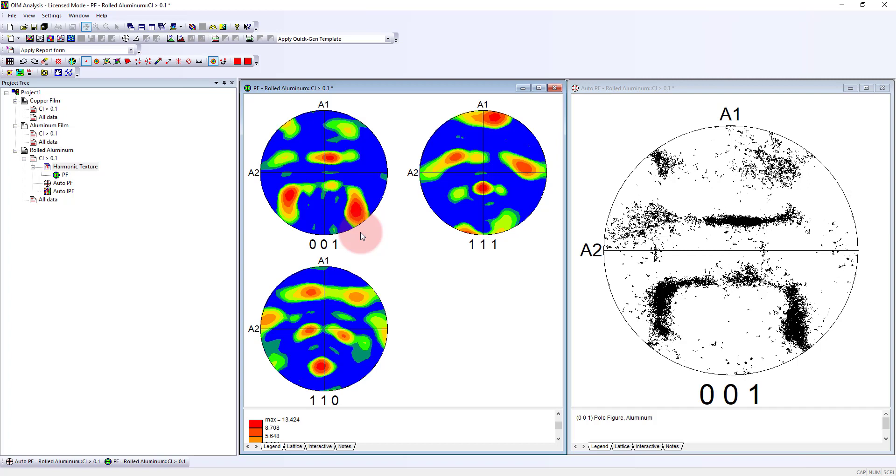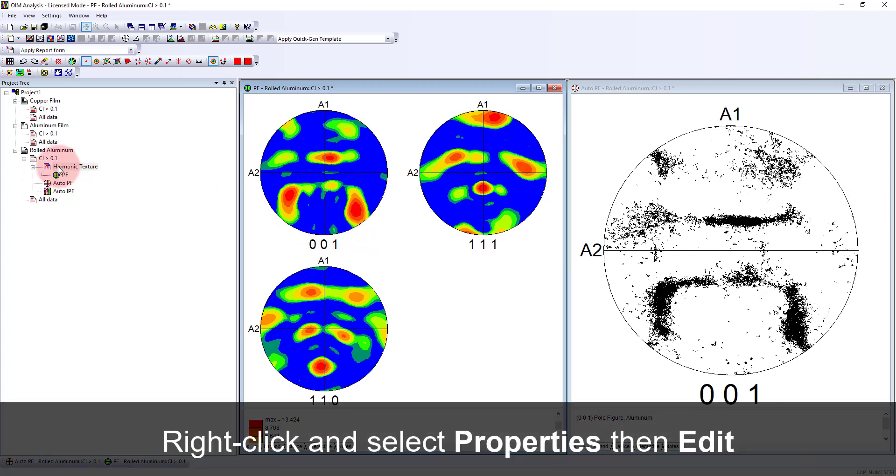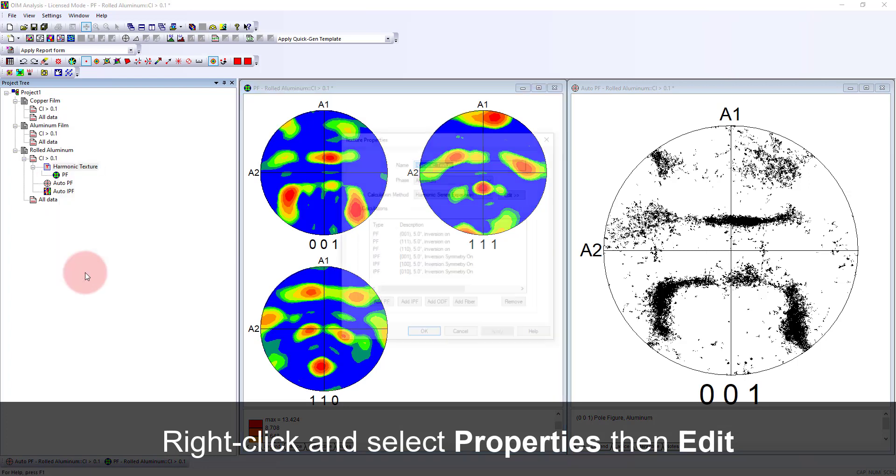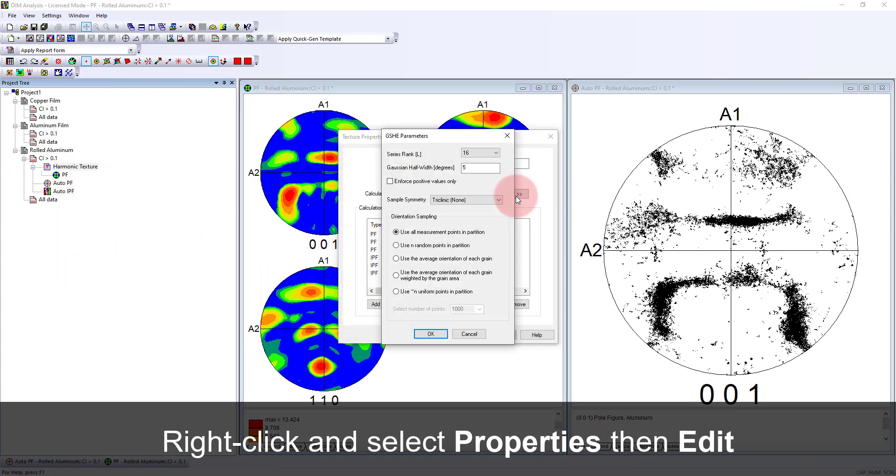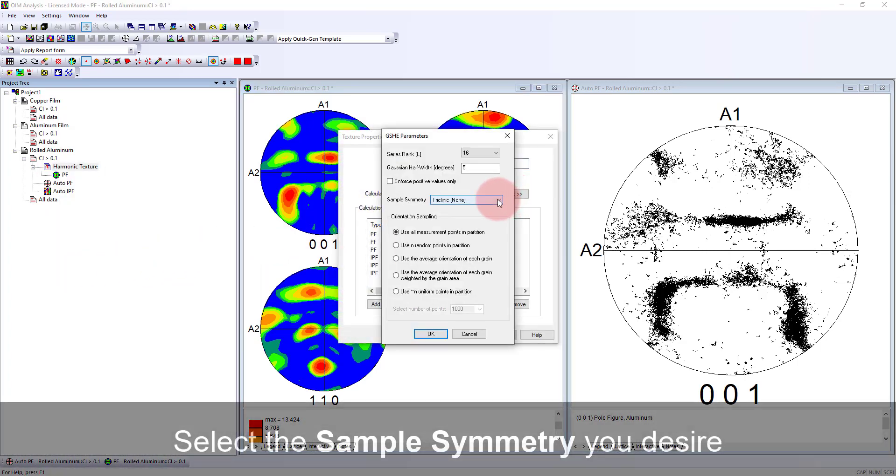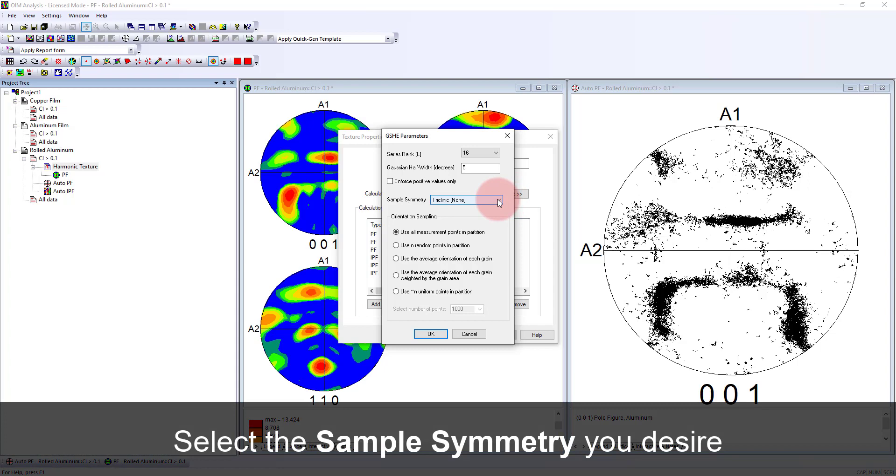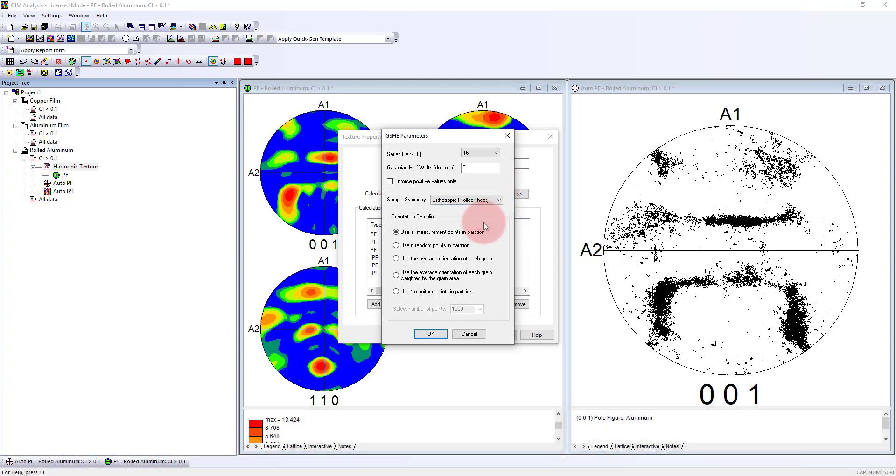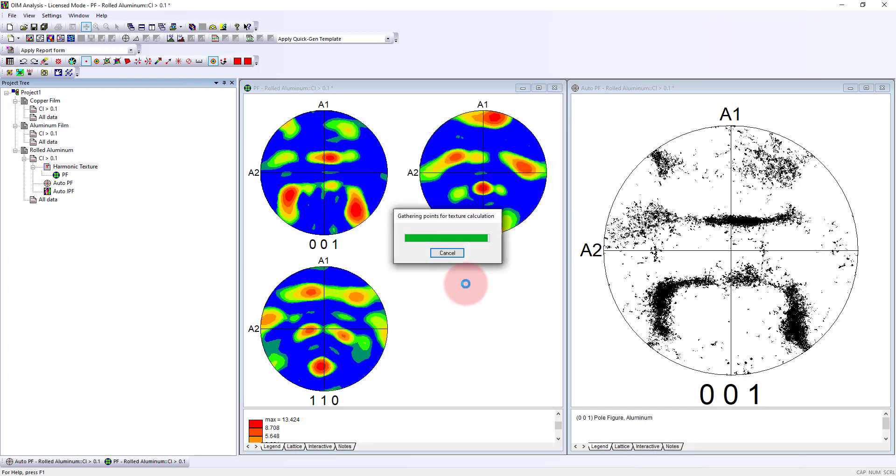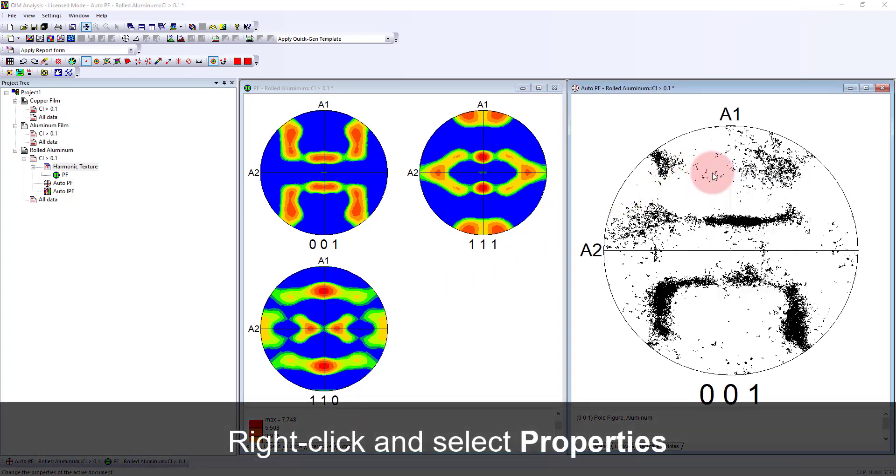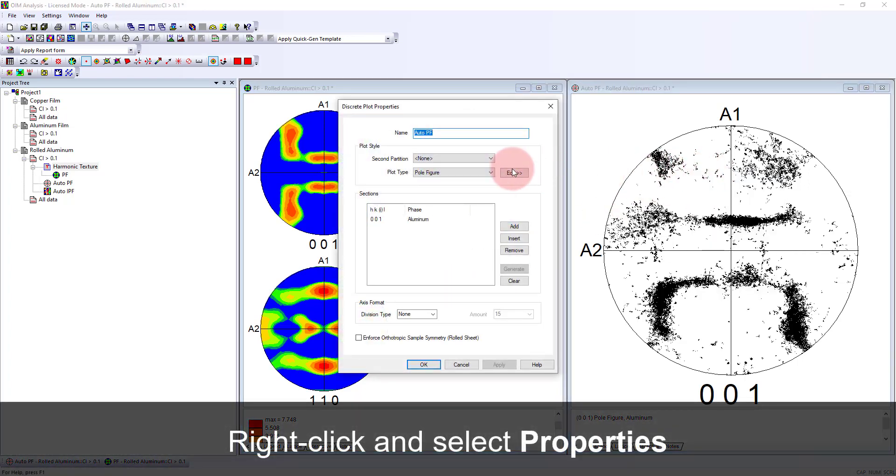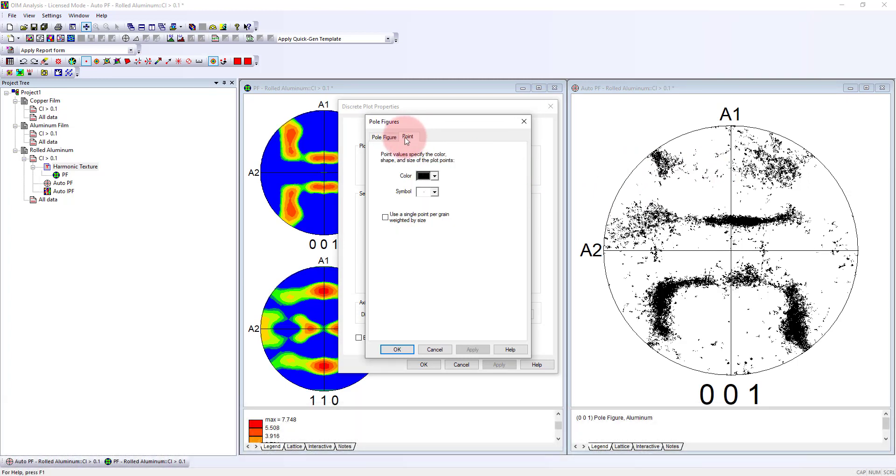One feature we're able to use, because this is a rolled material, is to apply sample symmetry. Right now there's no symmetry applied, but because we're looking at a rolled sheet, we can apply symmetry to this. It applies the symmetrically equivalent orientations to the calculation, and then we get a really nice pole figure that would be comparable to what we'd see with XRD data.